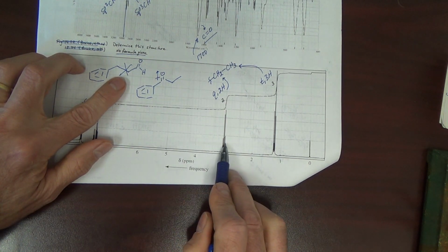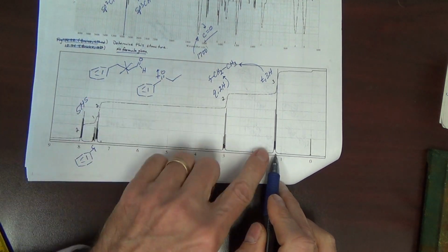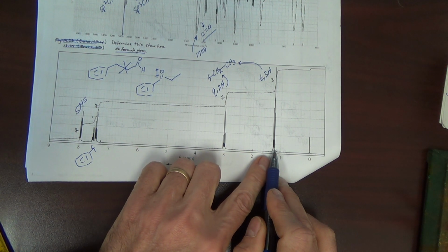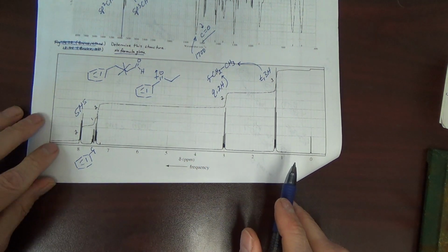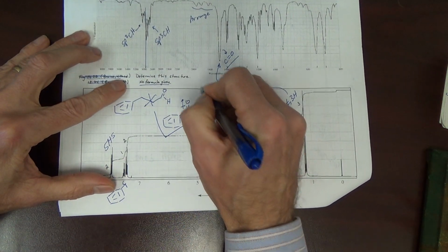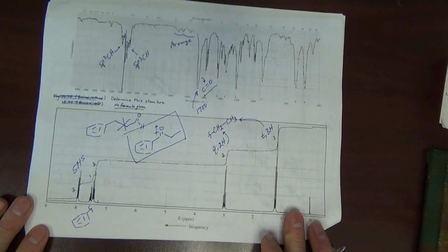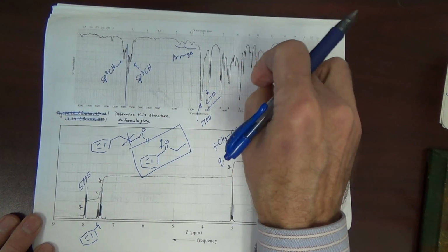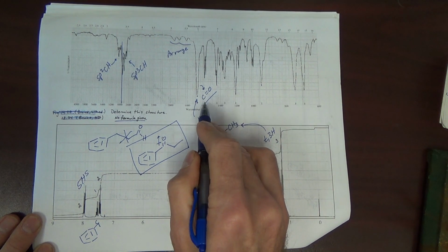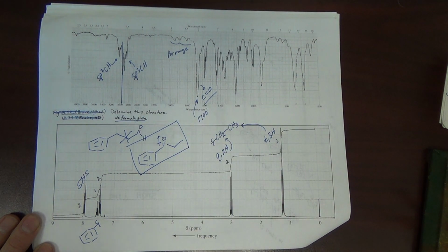More deshielded. The CH3 signal is not as deshielded. And then the aromatics. There's our structure. And here the IR helped us because otherwise we would not really be able to tell that there was a carbonyl group here.